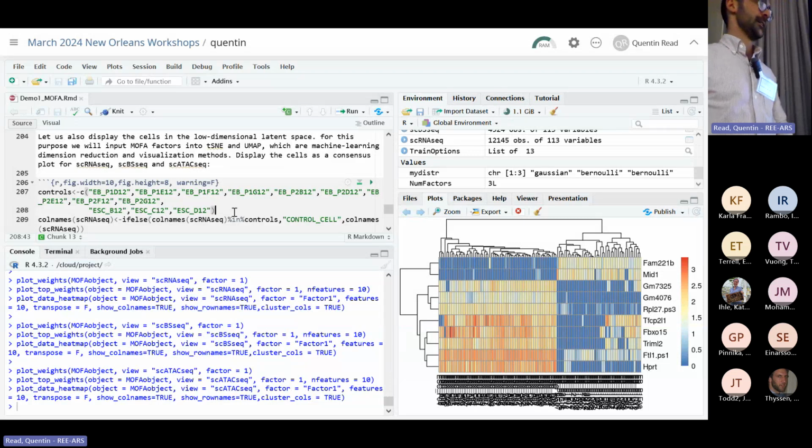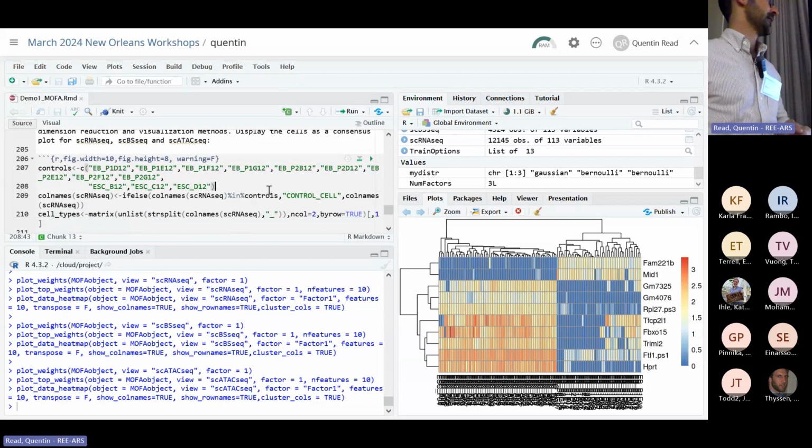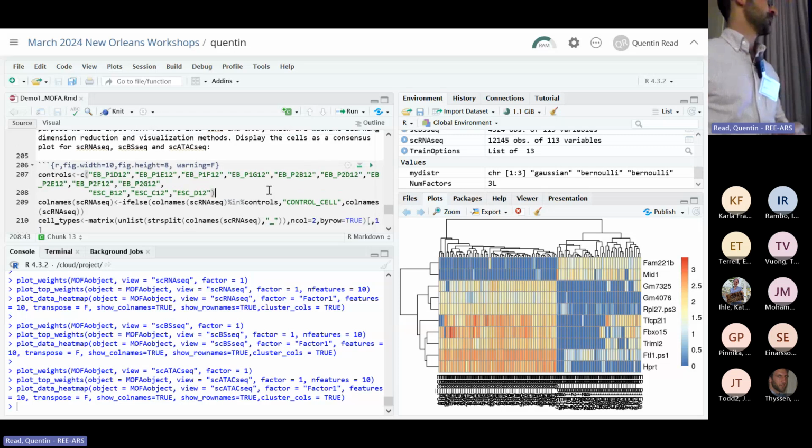Let's go ahead and finish up with this one. There's only about one more thing to show in this demo, and then we'll jump ahead and do some of demo 3 before lunch, just so you can get an idea of another method that's out there.